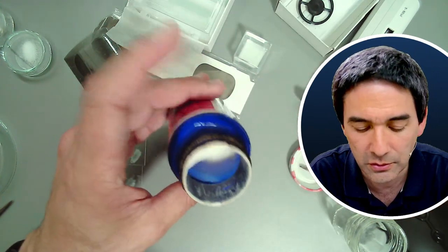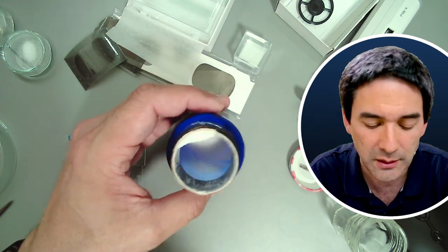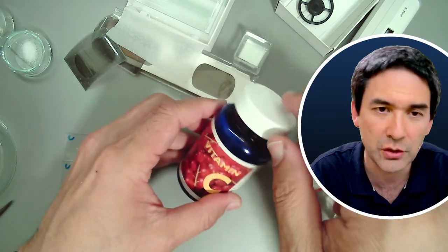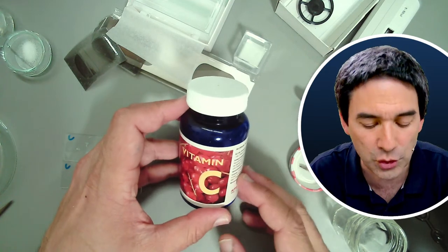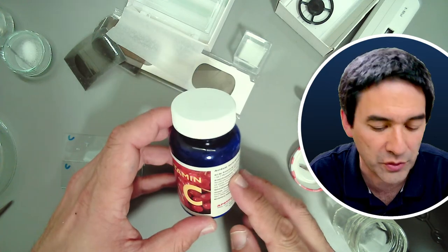And you don't want to eat it directly because you don't know the amount that you should take. But it's very good for doing some microscopy and crystallization work, because there are no additives in here that might actually disturb the crystallization.